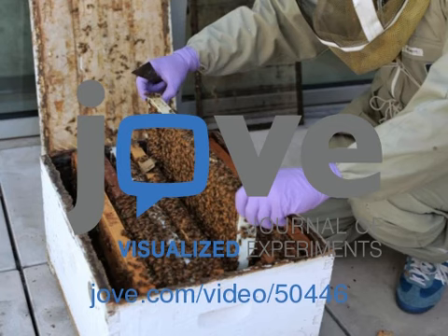Gustatory response scores, or GRS, for the treated bees were calculated from results of the proboscis extension response, or PER, assay. As shown here, the GRS in the bees that were injected with VG and USP double-stranded RNA mixture was significantly higher than the GRS in the GFP control bees, indicating the double knockdown bees were more sensitive to sucrose. The different letters above the bars denote significant differences between the treatment groups.